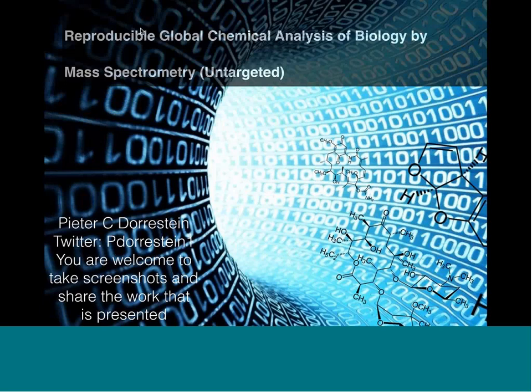Excellent, thank you. The next question is, can investigators using GNPS summarize the findings from metabolic findings broadly, or help understand the meaning of a metabolite in epidemiologic studies? So essentially, can you search the data to determine which metabolites are produced by bacteria? So yes and no. It's not that straightforward yet. We're building the infrastructure to do so. But basically, one way that you can do is, if you have, let's say, a data set such as American Gut, you can search the microbial data sets and at least get the reference.